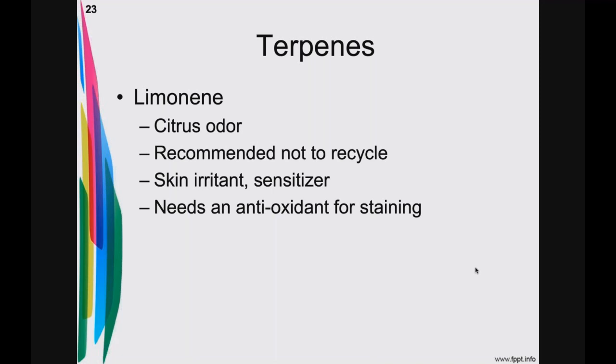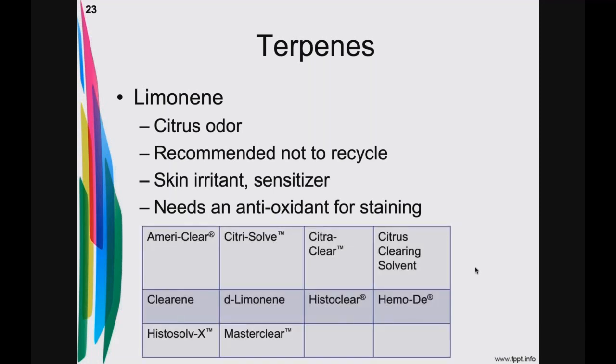But they realized if they added an antioxidant molecule to the limonene, or if they had an antioxidant in their mounting media, the eosin fading did not happen. But that's another reason why it can't be recycled. Because when you recycle, let's say, a limonene with antioxidant, and you did figure out a recycling process, the antioxidant doesn't come over, isn't recycled. So you'd have to add the antioxidant to use it.